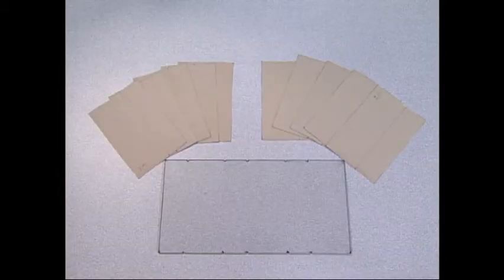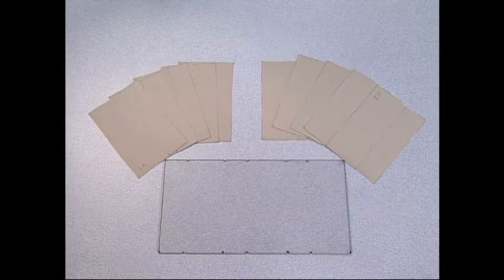The specimens are cut using a standard template. The length of the specimen is dependent on the tester's gauge length required in the test and should be long enough to extend through the clamps at each end. The width is wider than the width of the clamps. A line is then drawn on the specimen parallel to the long direction and is used as a guide for mounting the specimen.